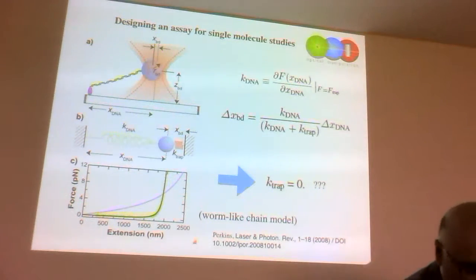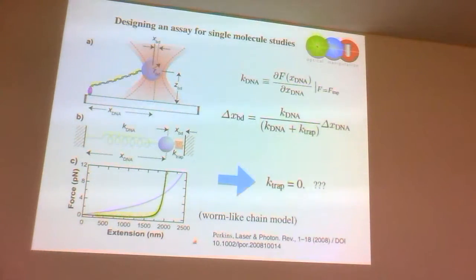I think I just misunderstood. Okay, so what we're doing is I attach a molecule. This bead is a harmonic oscillator, so force is just proportional to displacement. If I push this a certain distance and I know its calibration factor, it moves, so it's not touching anything. So that's what I measure. I'm not measuring it attached to this. Then this touches something else, does some single molecule biology, and all I'm measuring is F equals minus kx. I know k because I've calibrated the system, and I measure x and infer the force that's exerted.